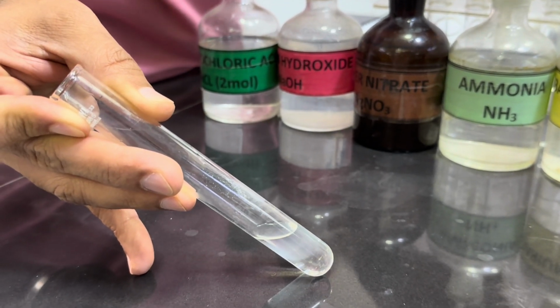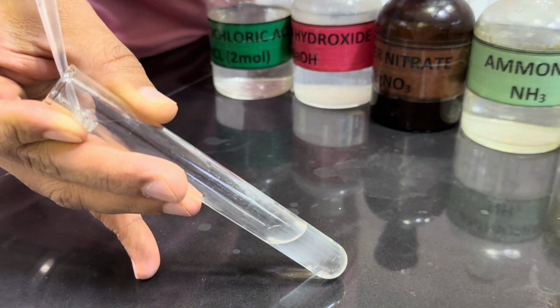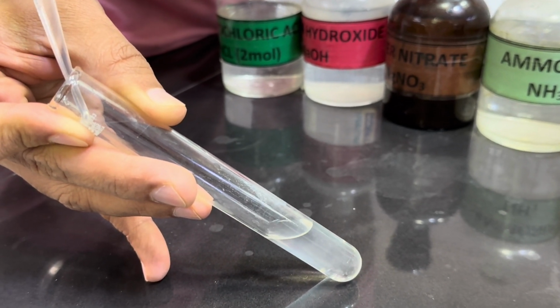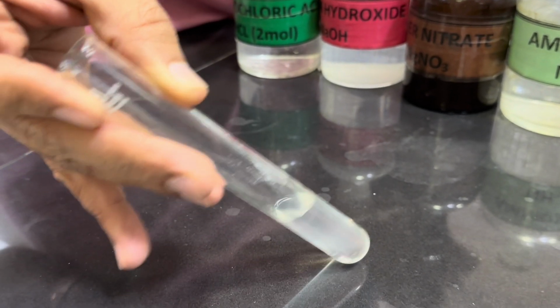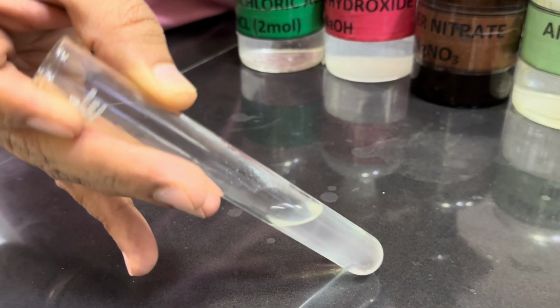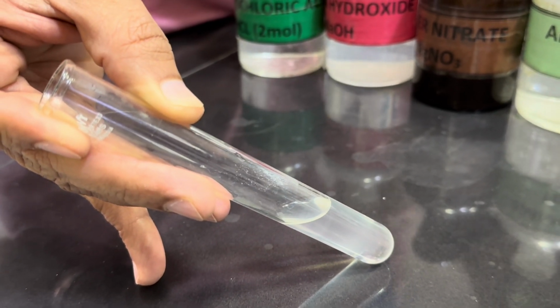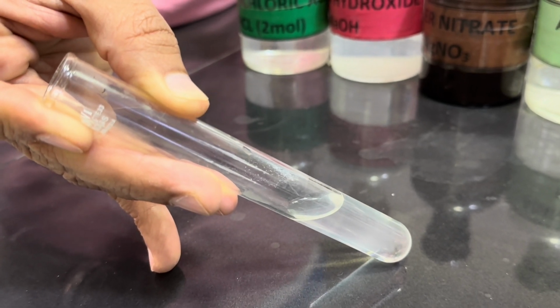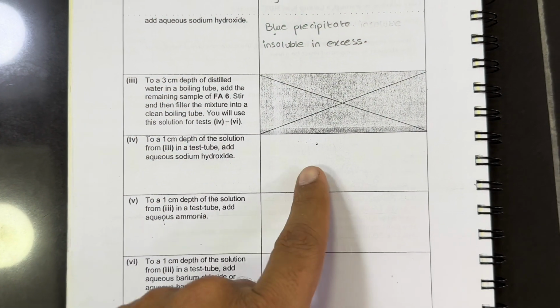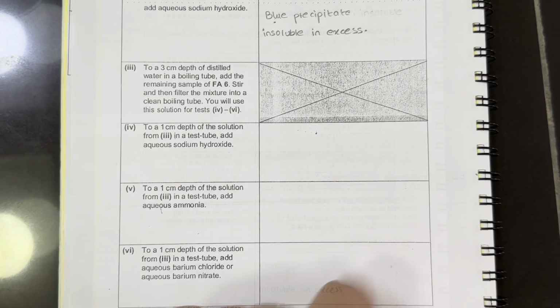And if I add this in excess, those white precipitates are not dissolving. So white precipitates which are insoluble in excess. We will record this observation here: white precipitate insoluble in excess, white precipitate insoluble in excess.